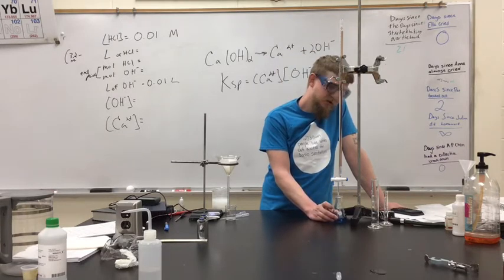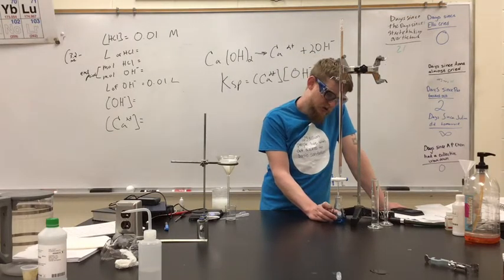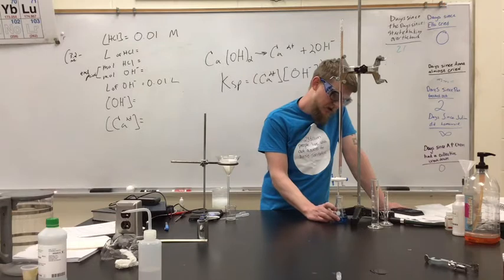All right, we're getting pretty close here. We're about 22. All right, getting close. We should see the color change here in just a few seconds, and we'll shut it off and read the buret reading.